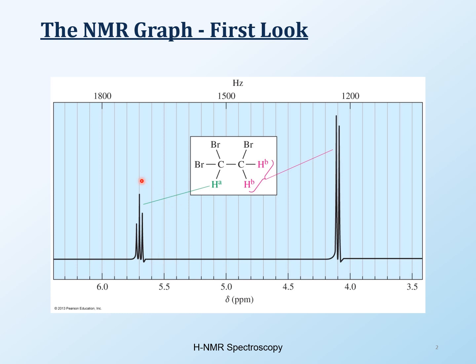Then we're also going to learn about, here, is it 1 peak or is it 3 peaks? So if you look at it, it's kind of split. Is this 2 peaks or is this actually 1 peak? So we're going to look at that also. And the last thing we will look at is the height of the peaks. So that was 3 things. And then why this peak appeared here and why did this come over here? So all these different things we have to cover, which is why this is going to be a long video for us. But that's what we're doing with the NMR.